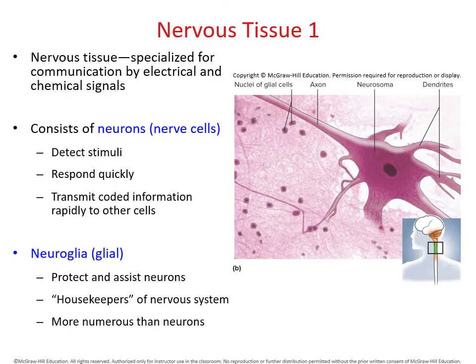All right, so let's take a look at the nervous tissue. Now, the nervous tissue is exclusively going to be found within the nervous system. So we're taking a look at our brain and our spinal cord. We really only have two cell types to discuss here. The first one are the main cells, which are going to be the neurons. You can see it here on the smear, this large structure right here. This is our neuron. The neuron, which are the brain cells and the nervous tissue cells, will be able to detect any type of stimuli and respond to it appropriately.